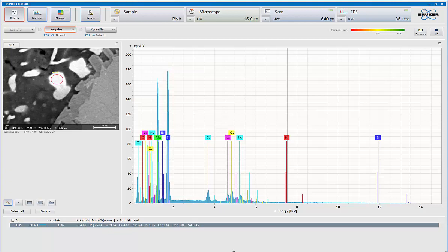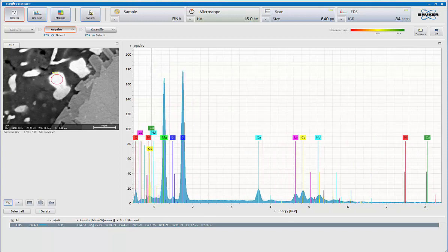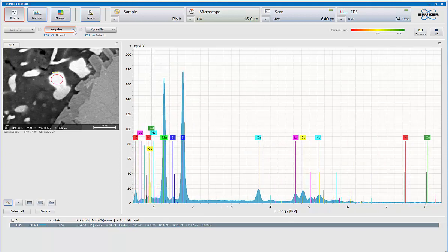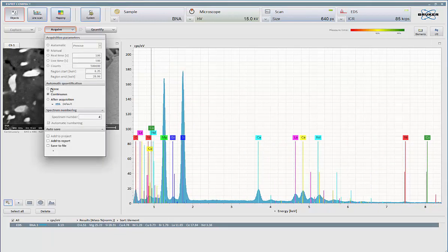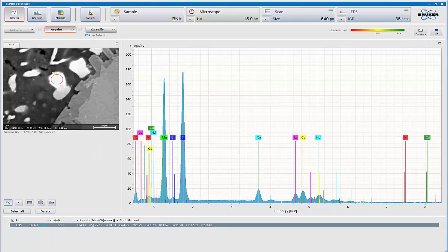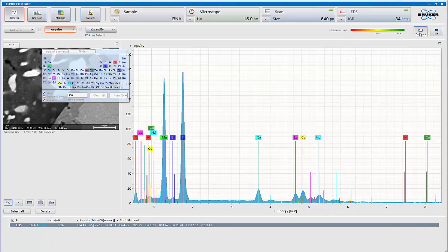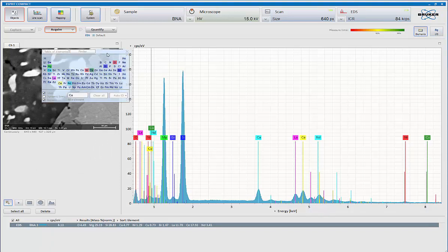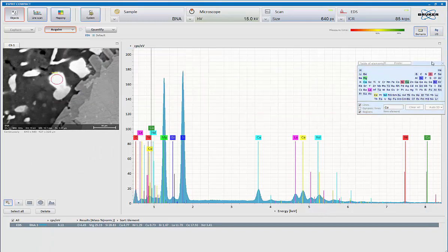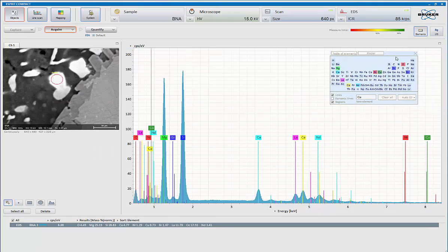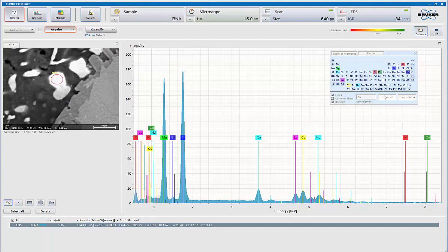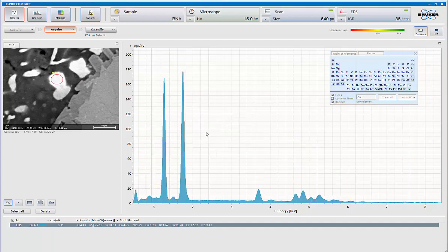Now a couple things here. There are a wide variety of tools that I can use to assist myself. So what I'm going to quickly do right now is I'm going to turn off the automated analysis. And I'm going to bring up the periodic table tool. This allows me to do everything myself. So if I here clear all, that will clear out the list.